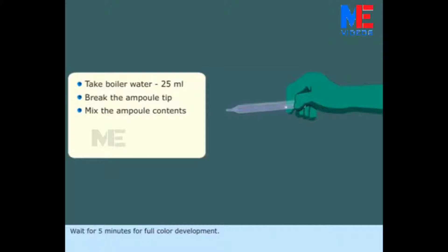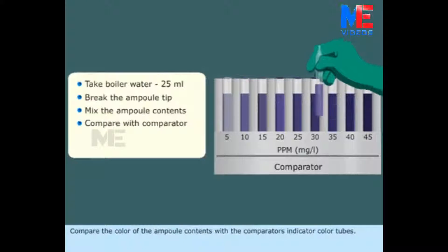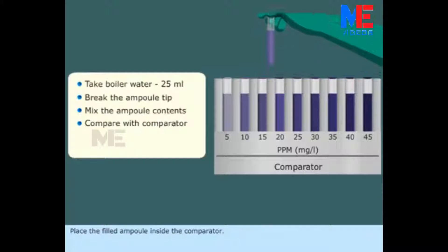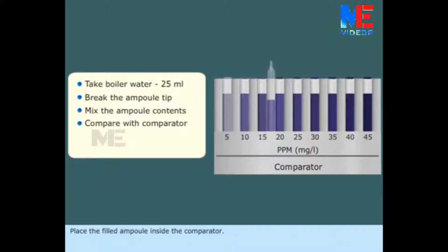Wait for 5 minutes for full color development. Compare the color of the ampoule contents with the comparator's indicator color tubes. Place the filled ampoule inside the comparator and note the reading.